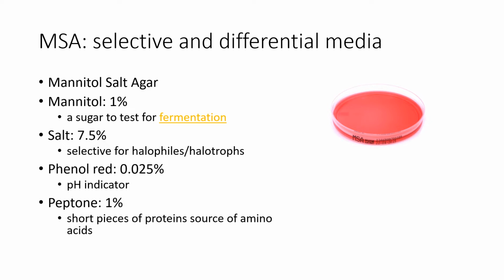Remember that that is too much osmotic pressure, that landing on a highly salted fish or highly sugary honey would mean that that bacterium would yield its water because the external environment is hypertonic compared to the cell itself, and so the cell would yield water and die. So putting 7.5% salt in there is really selective.